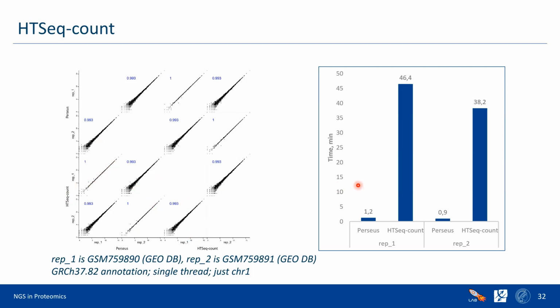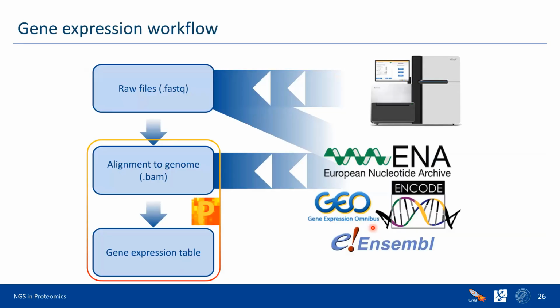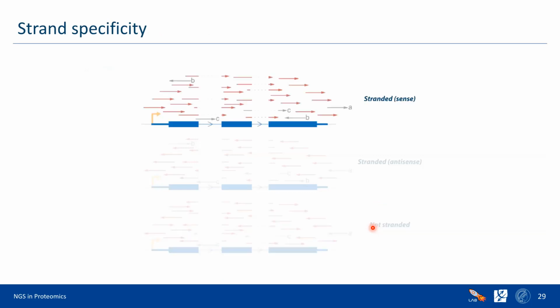One of the biggest advantages of Perseus, I think, is that it's extremely quick. At one conference, I think Matthias Mann asked why it's so quick. The main reason is that we're using the same platform: C# everywhere, from reading a BAM file to analyzing, and we are doing it very efficiently. As a result, we can easily take data for your specific cell line from, for example, the ENCODE or SRA database, and quickly find out the expression of different genes and make follow-ups.